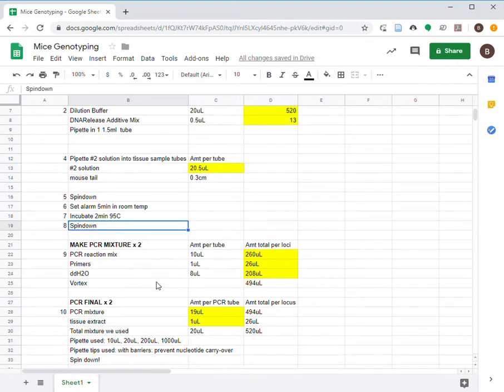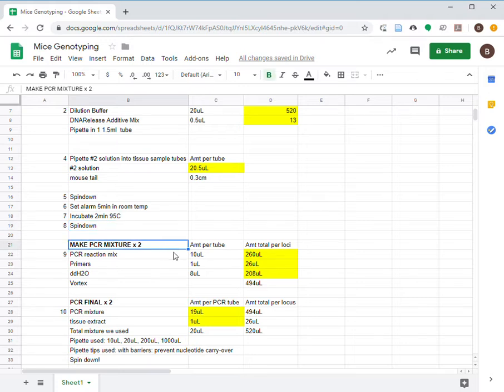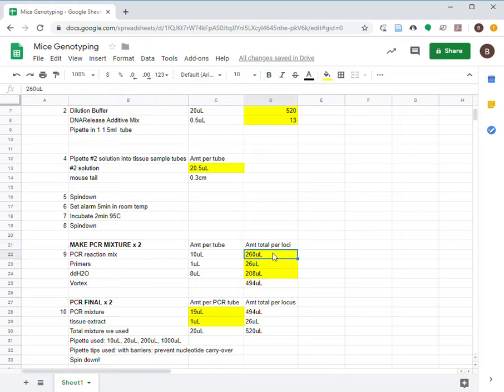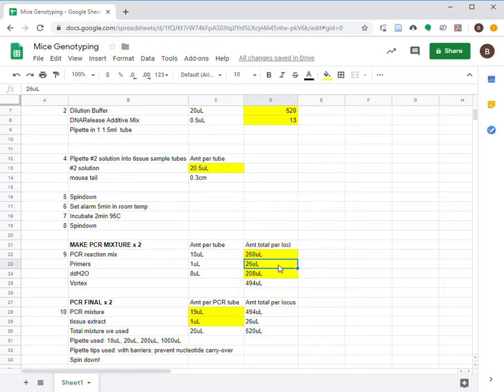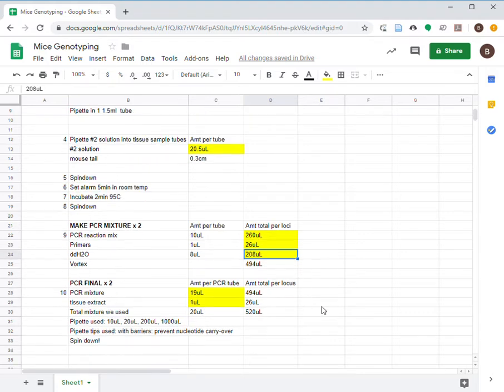Next, we'll make the PCR mixture. We do this step twice for the two loci that we want. For each of these loci, we use a 1.5 ml tube. Add 260 microliters of PCR reaction mix, 26 microliters of primers, and 208 microliters of double-distilled water. Repeat for another tube for the next loci.